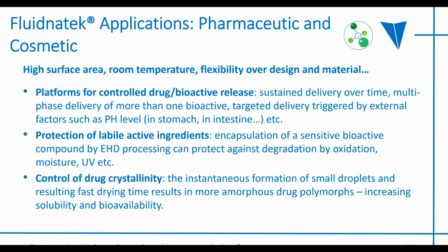And also, interestingly, because it's a drying process and it dries the material very quickly, you can actually use electrospraying to control the level of crystallinity of a drug product, which means that you can produce a more amorphous drug, which increases its solubility in the body and bioavailability.